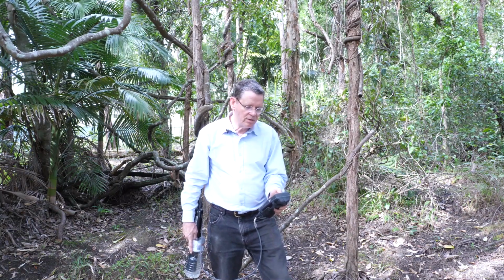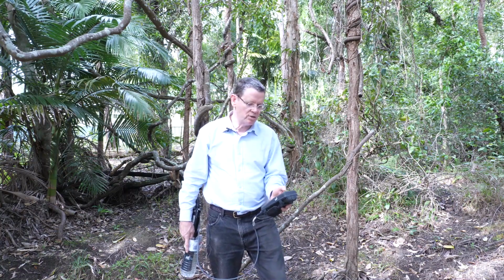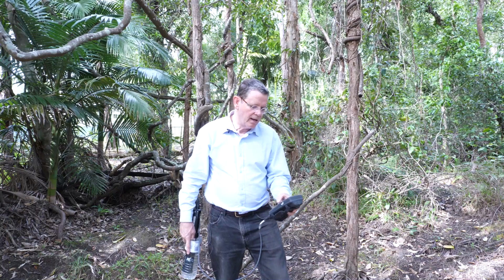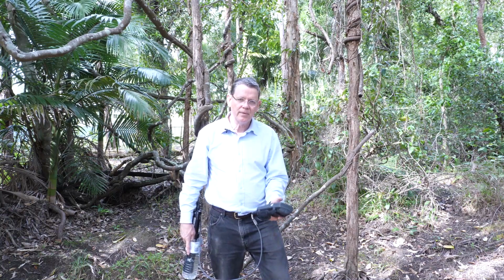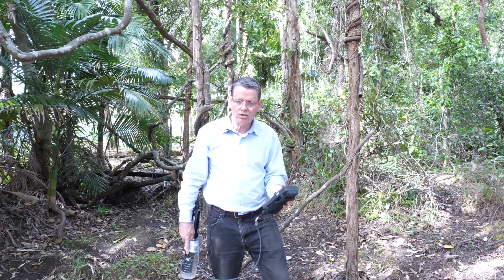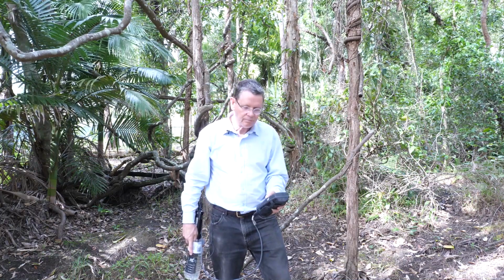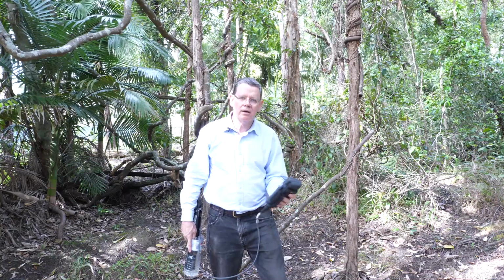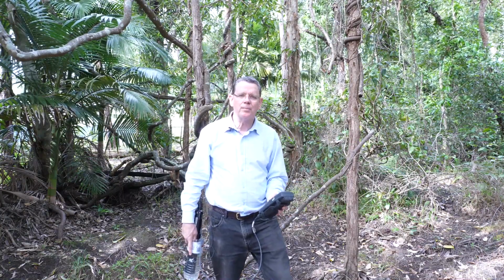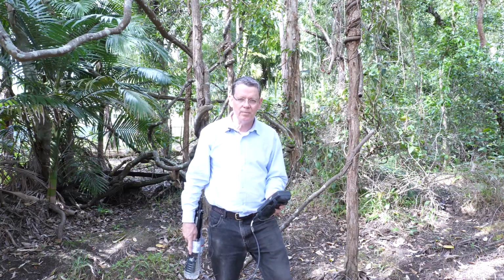Now the measurement that I've left to last, because it's the most interesting one, is the dissolved oxygen measurement. And it's 32%. So very, very much lower than anything we've seen during the course of the day. And once again, this is not a measurement that's right or wrong. It's a measurement that's telling you something about what's happening in the system here.